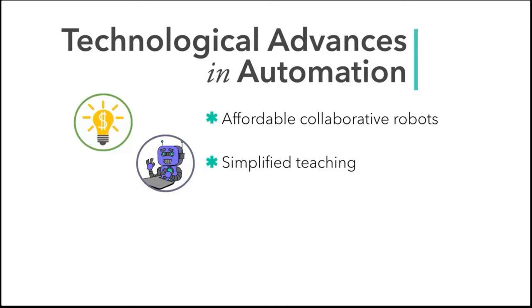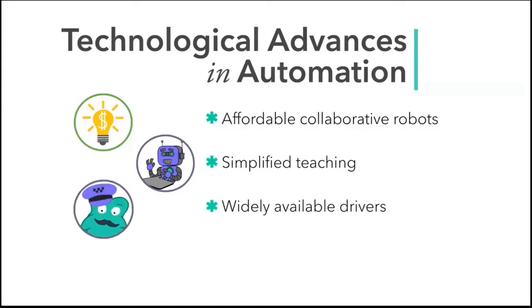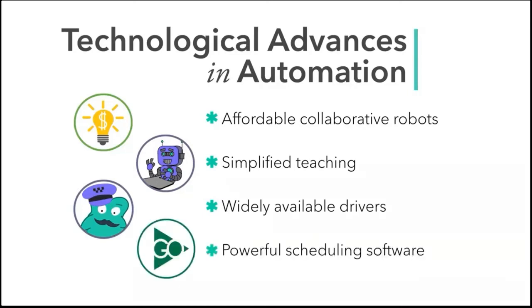And nowadays they have things like mobile robots and partial compliance, where you teach the robot generally where the nest is, but it'll wiggle itself the rest of the way down, which gives you way more flexibility in the process. Drivers for commonly used pieces of equipment are widely available. As users of Green Button Go, for the most part, we don't have to write our own drivers or worry about low-level commands. These things are taken care of for us, so we can focus on higher-level pieces of the process, like automating our workflows and procedures using the scheduling software.